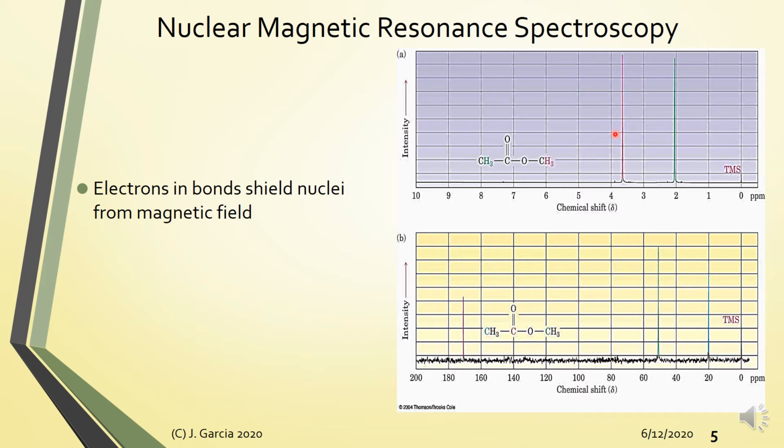In the case of proton NMR, we are looking at the protons, yung H1. And for carbon-13 NMR, we are looking at the carbon nuclei, okay? Now, since the proton and carbon nuclei are bonded in the molecule, each bond contains electrons, alright?